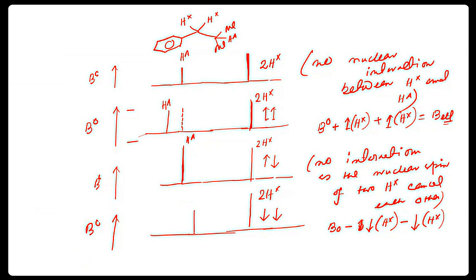So here, what is the effective splitting? Here we consider no interaction. So the extent of splitting is the same here, because there is no interaction. That's why, look, these are on the same line. Here we just consider no interactions for our discussion, and we see there is no interaction because these two nuclear spins cancel each other. It has basically zero inherent magnetic field. Basically, it's B0.